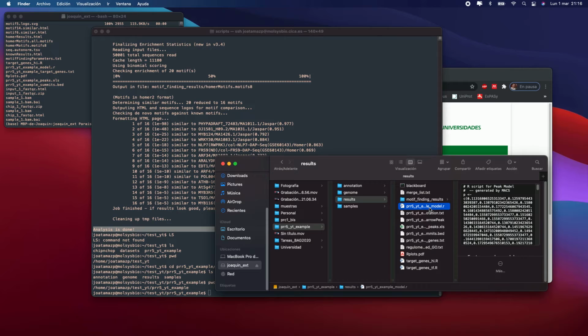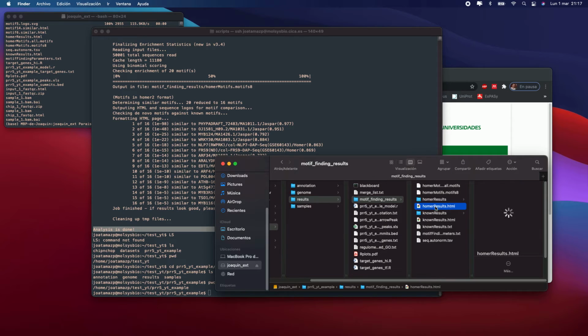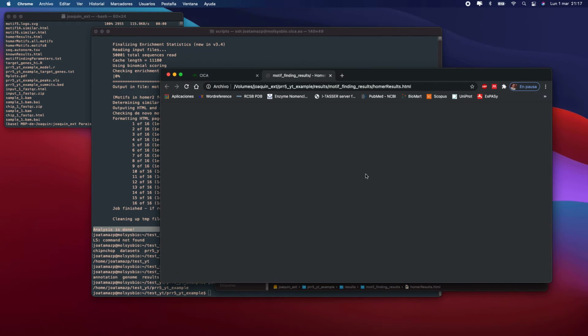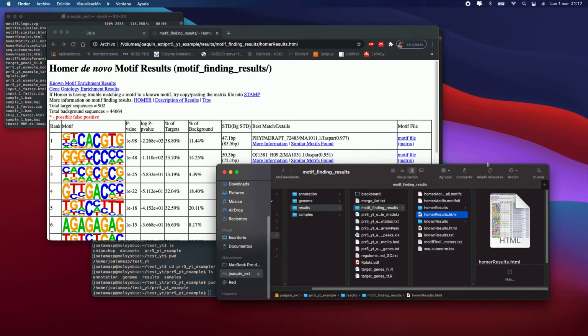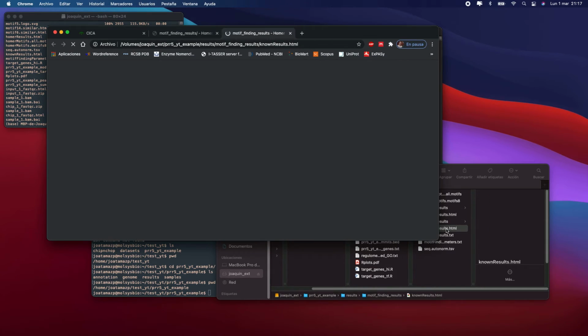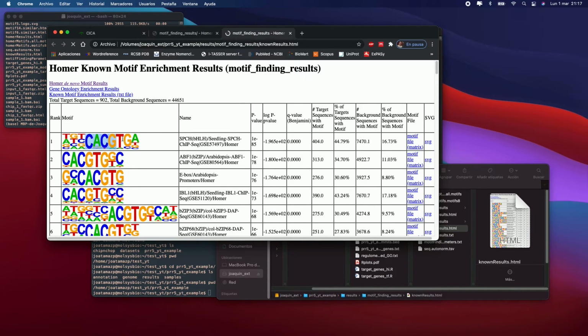First of all, the motif finding, that is the last thing you have analyzed, might be useful to identify some interesting de novo motifs, for example CACGT, or in the case of, you see, the CACGT that is targeted by ABF1, for example.